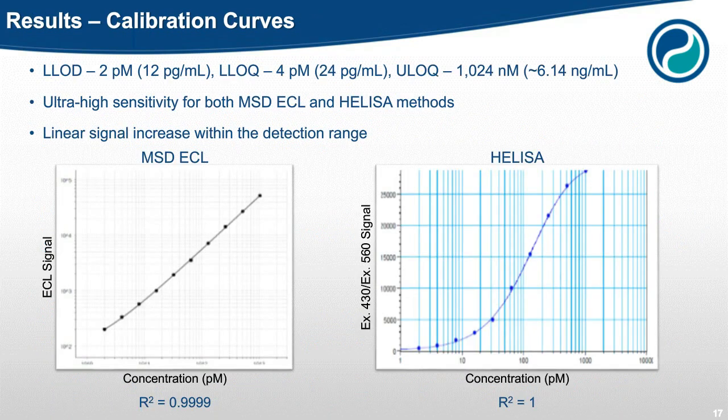We have validated these assays for a series of parameters, including the calibration range, precision and accuracy, selectivity, linearity of dilution, and specificity. The data generated from these tests will be presented in the next several slides.